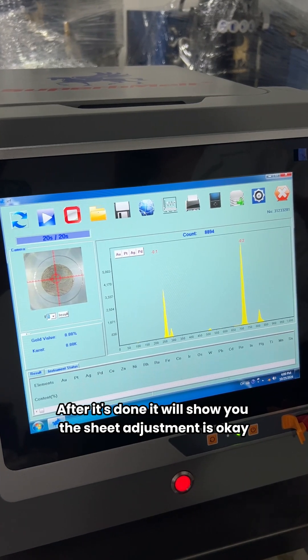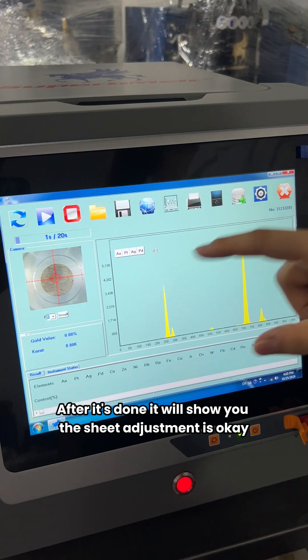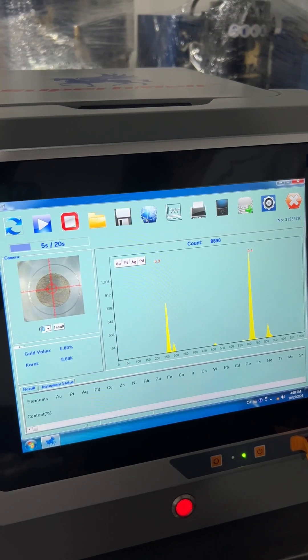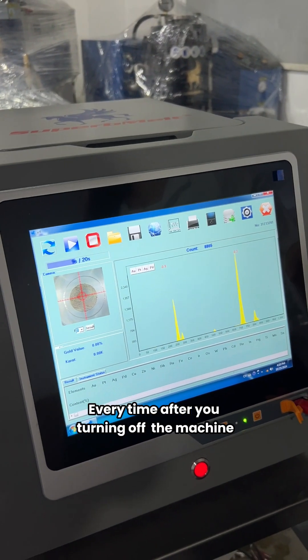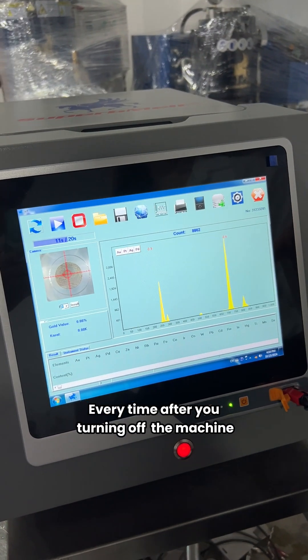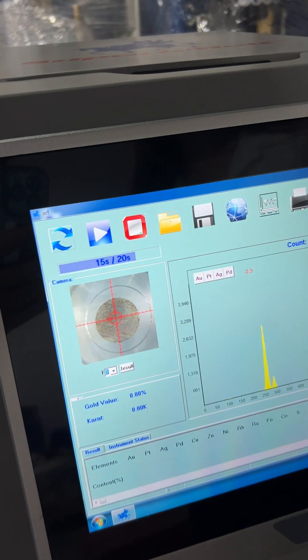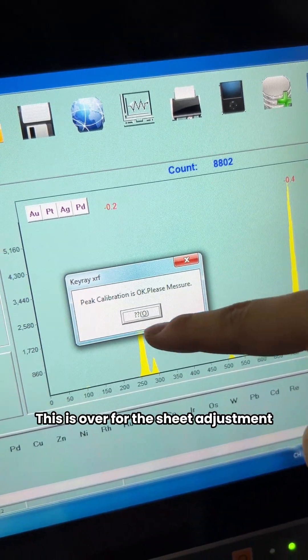After it is done, it will show you 'sheet adjustment okay.' Every time after you close up the machine, you need to do the sheet adjustment again. This is the completion of the sheet adjustment.